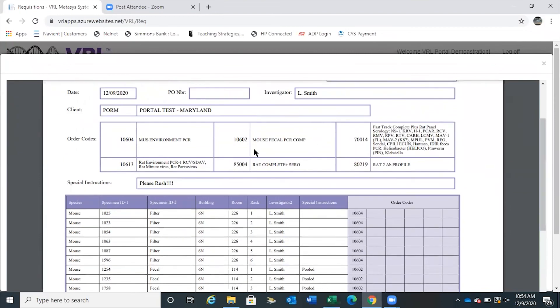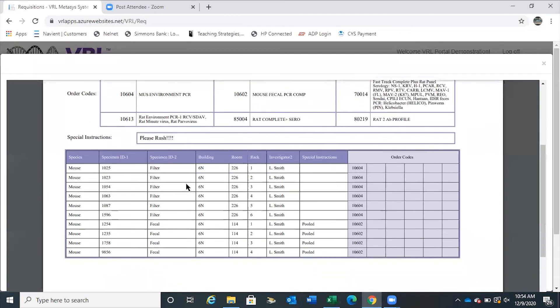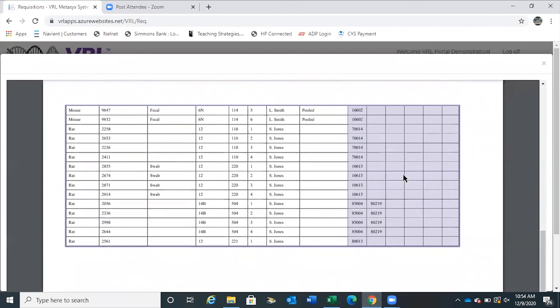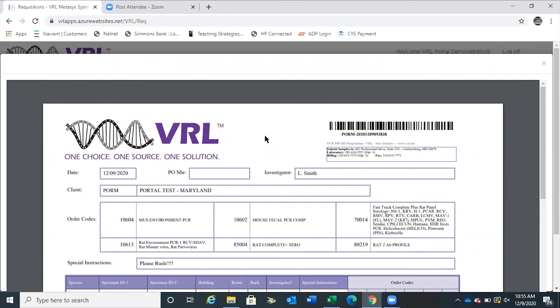You can see on the requisition PDF that all of your test codes now have descriptions next to them. If you happen to notice that you've included an incorrect test code, please call us — do not resubmit your samples. The special instructions from the first cell are included at the top of the page. All of your data from species, specimen IDs, and everything else that you included appears below. You can keep the PDF for your records, but please remember to print, place in the box with your samples, and send to VRL.